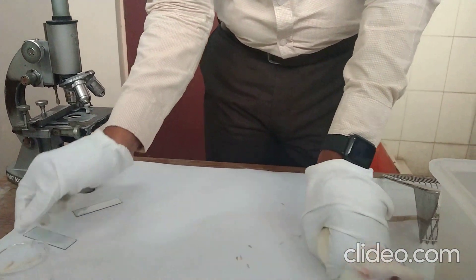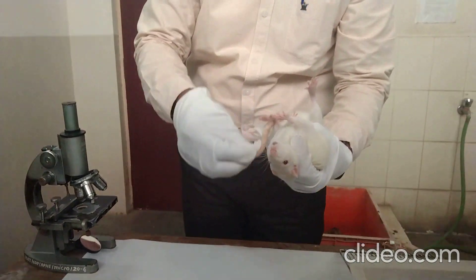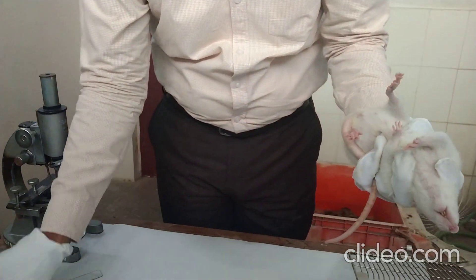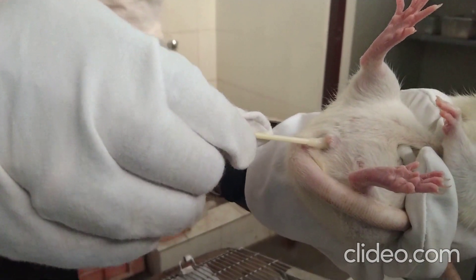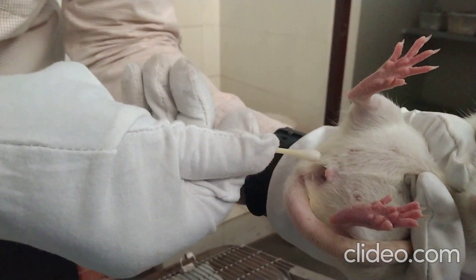Hold the rat like this, then insert the earbud slowly into the vagina and rotate it clockwise. After that, slowly remove it.